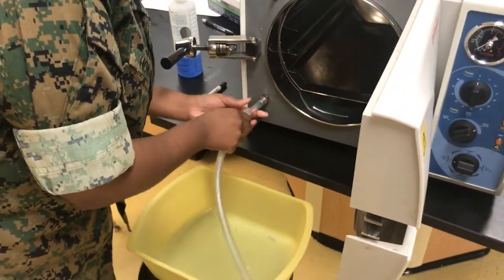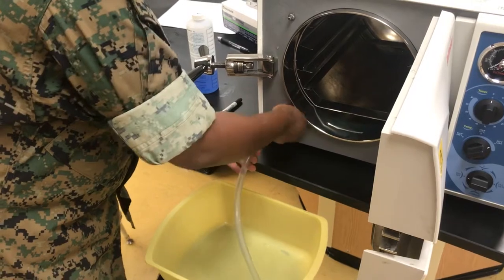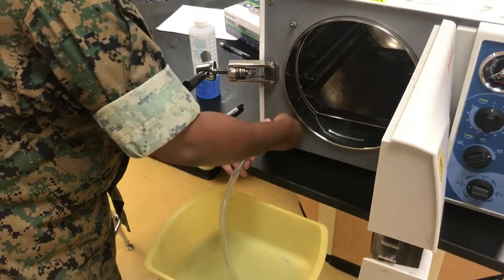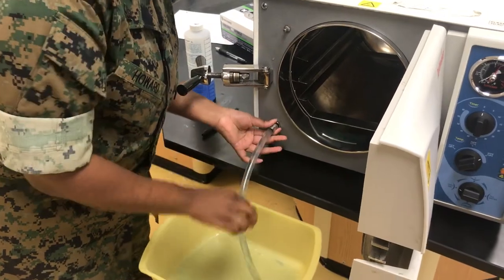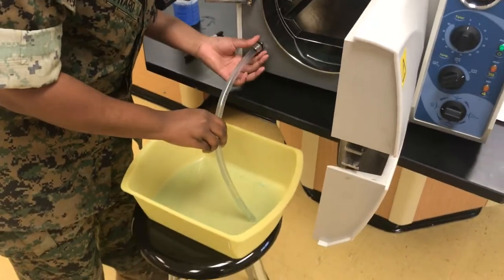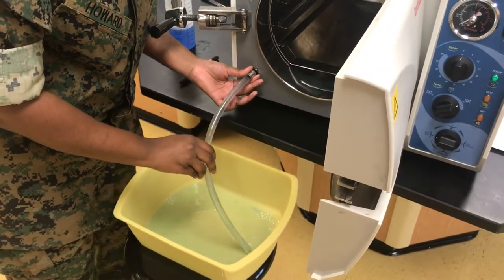First, you're going to put the tube on here like this. And basically just let it drain until there's no more water coming out.